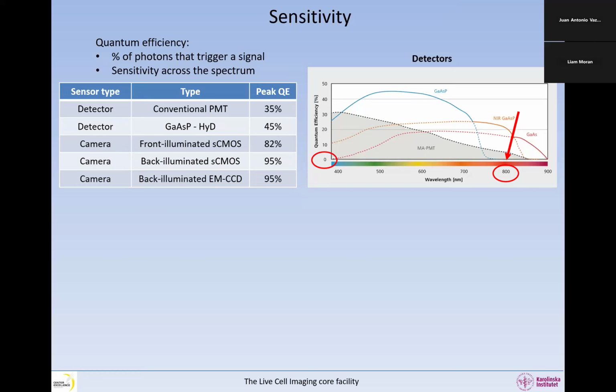So the scanners in general start dying before the lasers as well. So the detectors are often not what goes first on the point confocal. However, the electronics can age. That does happen. And also, very often, the newer electronics is faster. So there's a lot of development in the electronics, and therefore we have more collection, for example, better amplification, faster systems, etc.